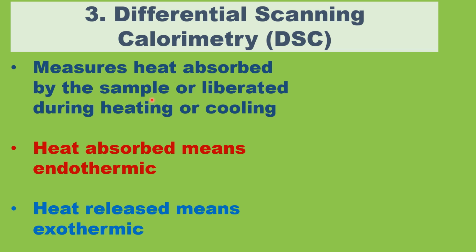In this technique, we measure heat absorbed or liberated by the sample by heating or cooling. Heat absorbed means endothermic process, heat released means exothermic process.